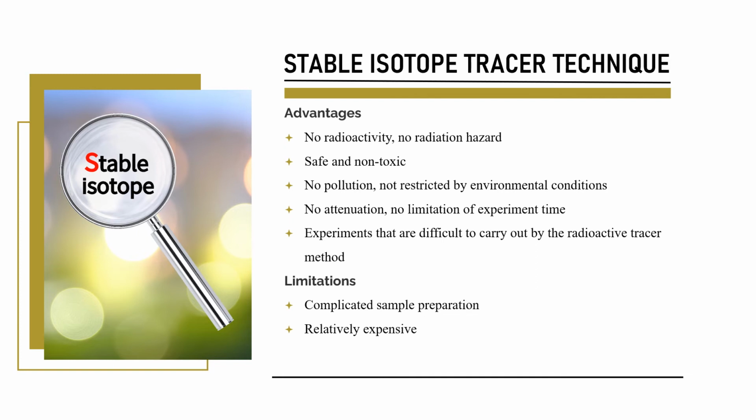When stable isotope tracer analysis is performed using mass spectrometry and nuclear magnetic resonance spectrometry, molecular structures of tracers can be observed via the labeling positions. In contrast, in terms of radioisotope analysis, complex chemical degradation and the separation of degradation products are required to determine the molecular structures. Therefore, stable isotopes can be dual-labeled with radioisotopes to compensate for the lack of radioisotope labeling alone.